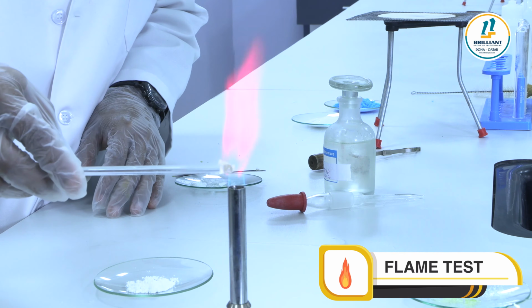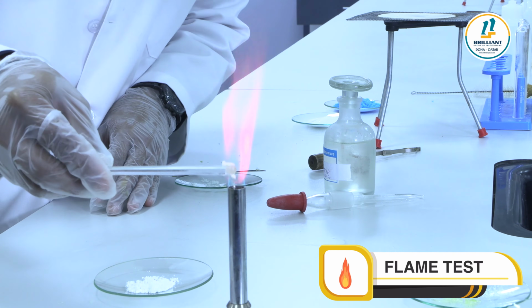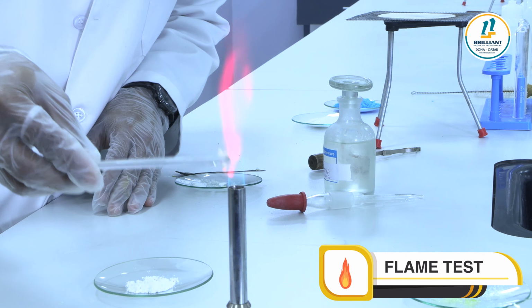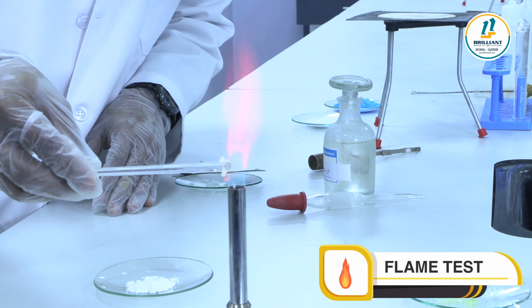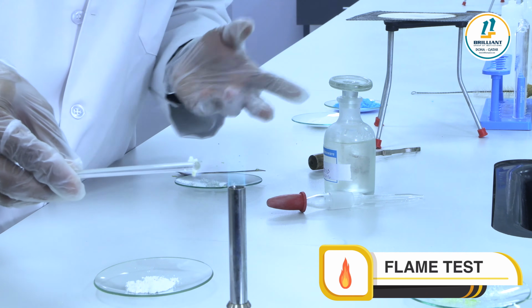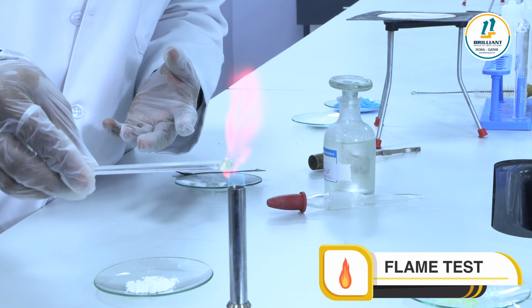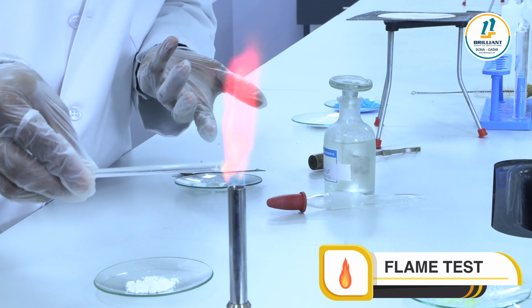Let's see the next color. This is the crimson red color. If it burns with a crimson red color, it indicates strontium may be present. There is another color, brick red, which we studied, different from crimson red. So this is the brick red color, which indicates calcium may be present.